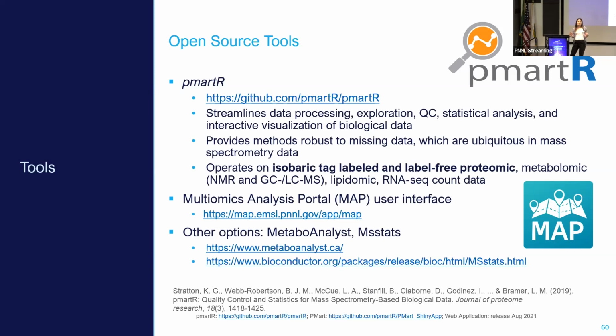It took us a little while to finally figure it out, and it involved talking with the experimental scientists here, and then talking with all of the individual sites that were sending us samples. What it ended up being is that there were two different types of sample tubes used. One of them had EDTA in it, and one of them did not. And it was that EDTA that kept showing up really high in some samples, but not others.